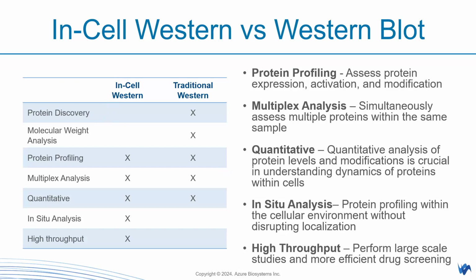And it can also be applicable to virology. Okay, virology studies like assessing the viral titers, like how your viral replicates respond to the drug that you induce on the wells. Okay, so it is a very good antiviral agent screening. And of course, drug screening for your markers of progressing diseases, or using silencing RNA or therapeutics as a compound to do that. So this is in-cell Westerns.